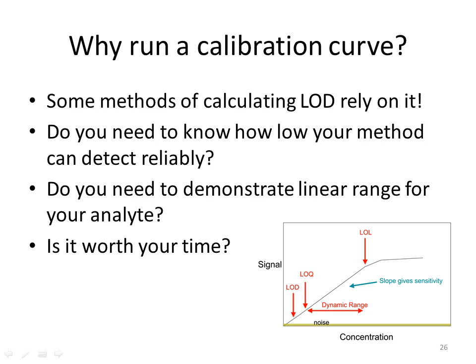That's one question. As we had mentioned a couple of times, I don't like to really dirty up my system if I don't need to show the upper limit of linearity, so I often don't go very high, but there are some cases where people ask, how much can I load and what's the carryover effect? So it is worthwhile if you have the time. Because the point is, at the end of your method, you don't want someone to be like, you didn't do this and I have questions about that. Then you have to go back and do it all over again, because repeating portions of a response curve are not very useful.